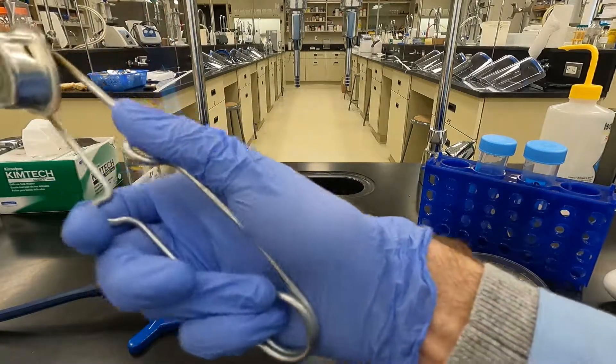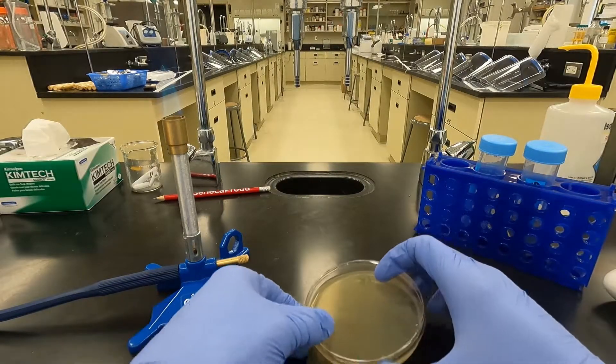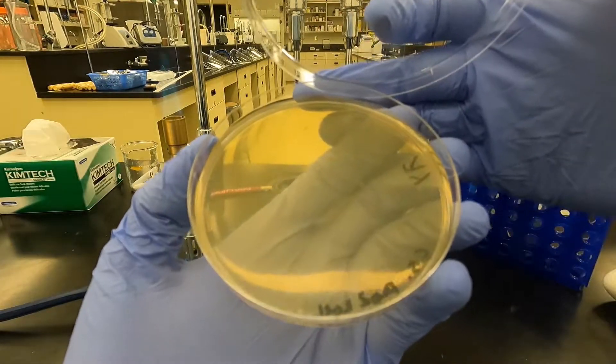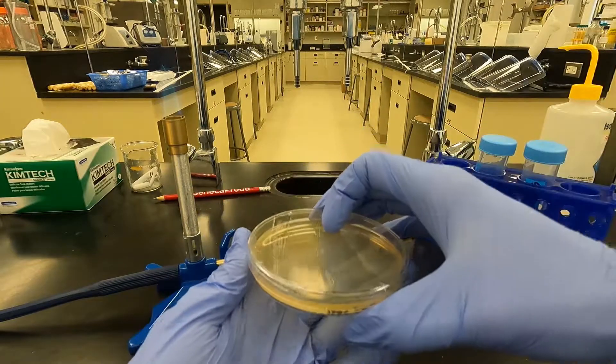Here we are in the lab for a short video on plate lysates with lambda phage. Here's a plate with lambda phage that was incubated overnight with its host E. coli. You can see all the plaques have spread out and kind of fused together for confluent lysates.